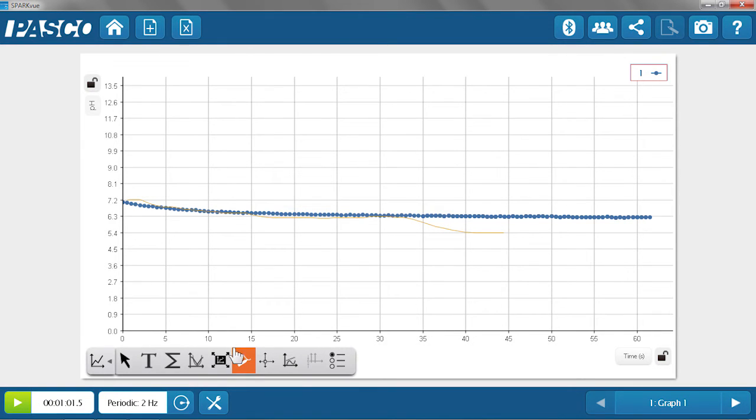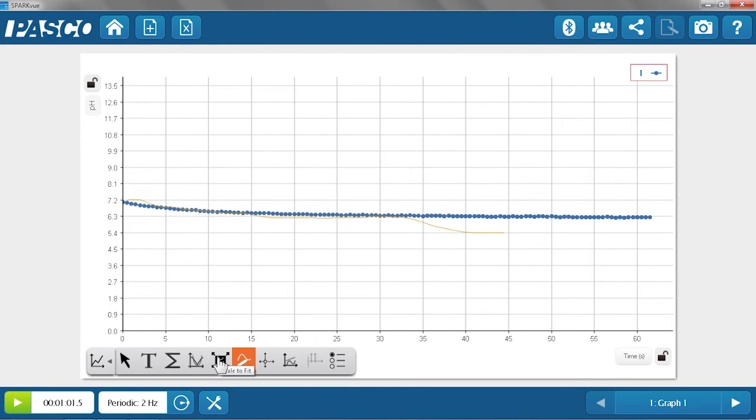All right, we'll go ahead and stop data collection, and we can rescale the graph to get a better view of our data. As you can see, the pH decreased as carbon dioxide dissolved in water and created carbonic acid, but not quite as dramatically as I had initially predicted.